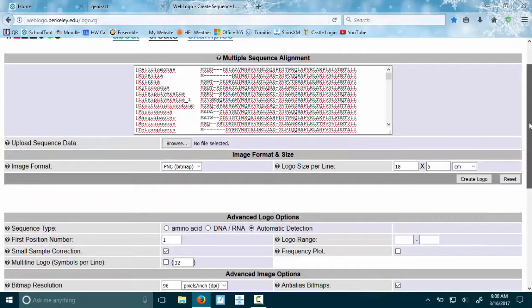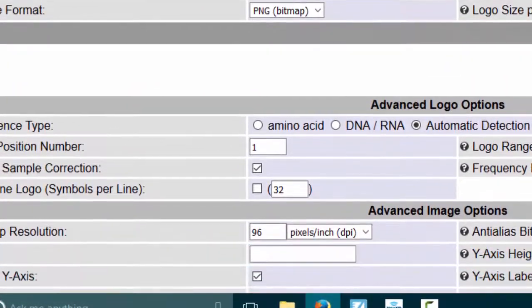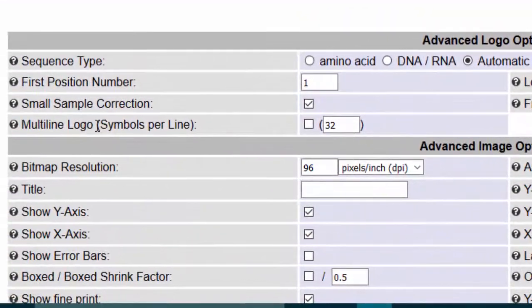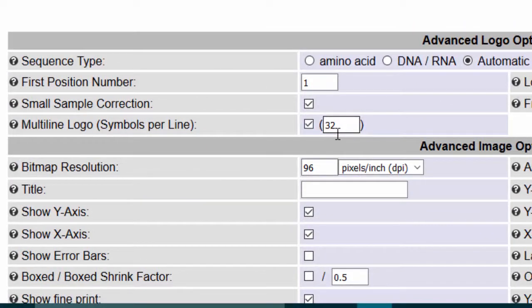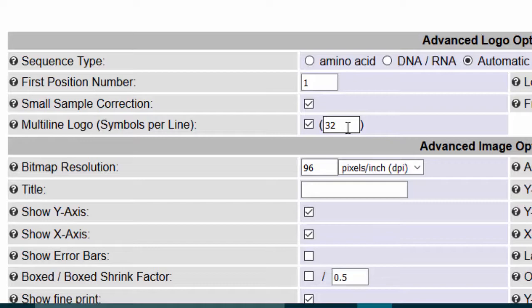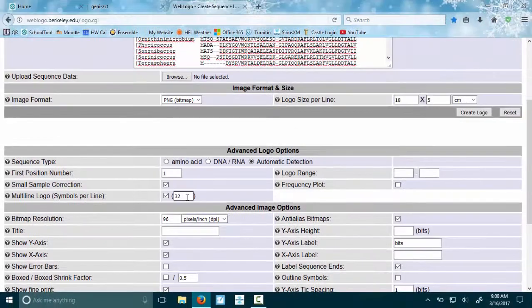Before we say to create the logo, which we'll press in a second, we are going to change or make sure that it says a multi-line logo. If you don't like the format of your results, this is going to make sure that there are 32 letters on each line. If you don't like that, you can change it to 50. I'm going to leave it as 32, and then I'm going to say create logo.